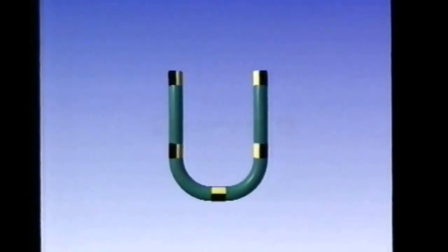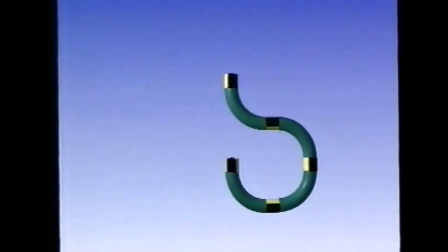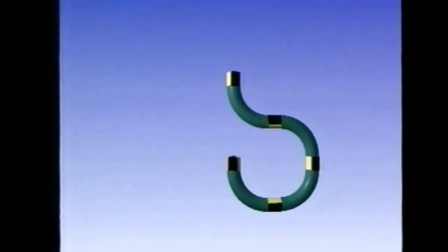If we form the tube so that both ends are on the same vertical axis, it naturally bends to form the inverted question mark. Now stop the rotation.